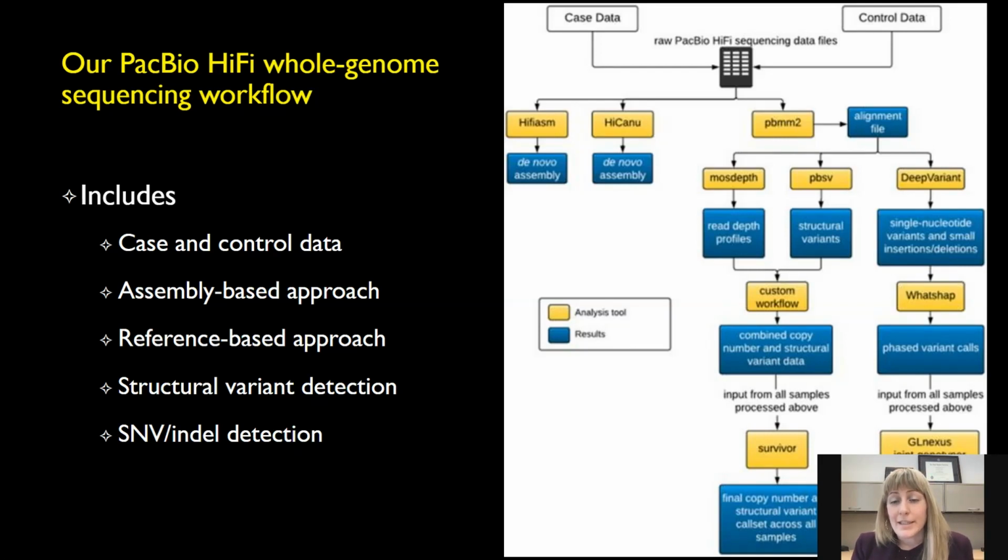If we look at the left side of this diagram, though, we can see that there is an assembly-based approach aspect of this workflow. On the right side, we see there's a reference-based approach. So the reference-based approach is actually very similar to what we've done previously with short-read sequencing data, just some of the tools are a little different, but they're the same idea.